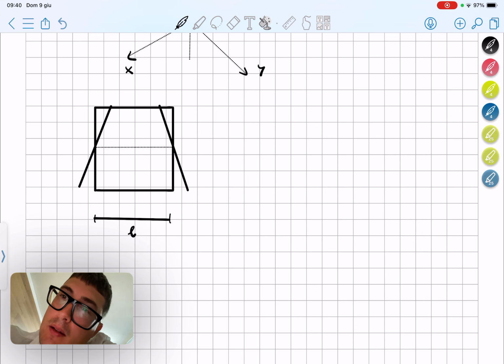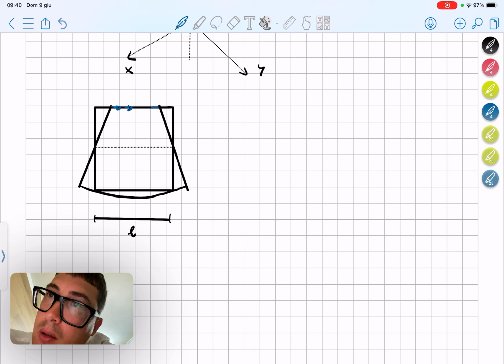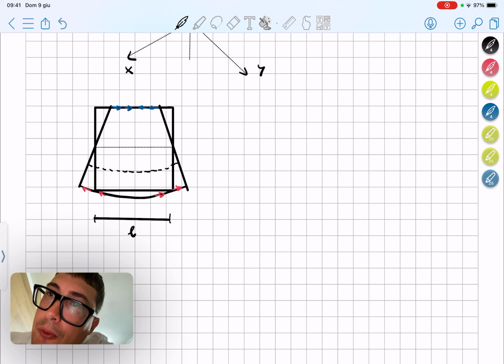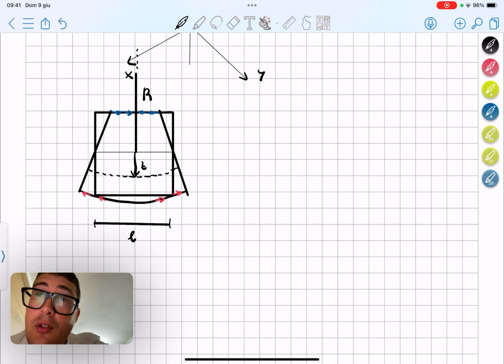And the bending of this element will identify two regions. One region in which there is a compression, which is this one, and the region in which there is an elongation, let's say a tensile deformation, and the neutral axis stays there. So we can identify a curvature, so this lower part as we need to insert a certain variable, which we call z, and there is also a radius of curvature of this element, which is somewhere in the upper or the center of this radius of curvature.